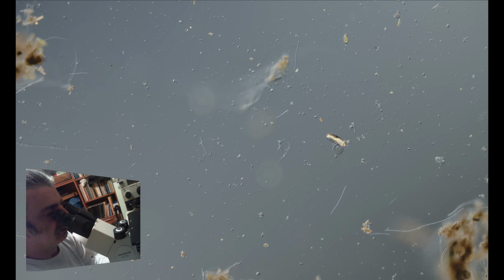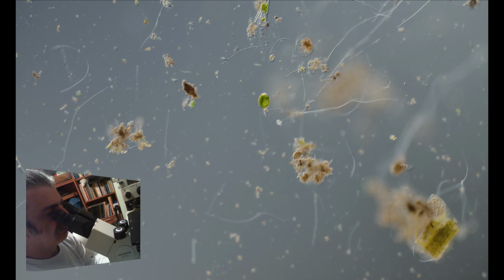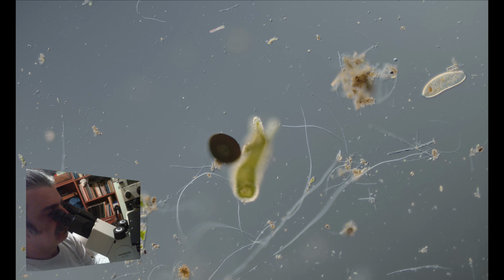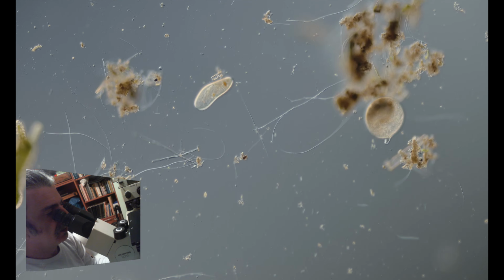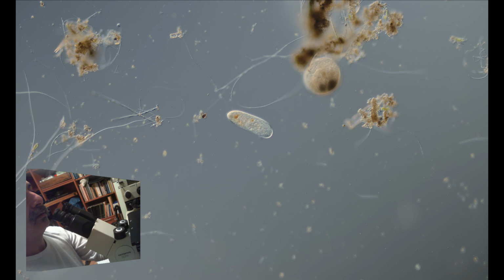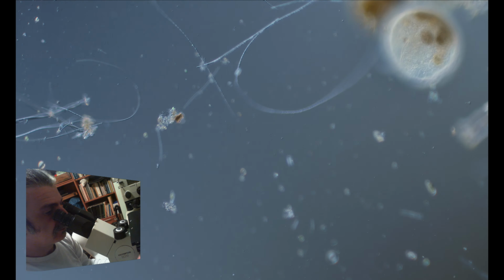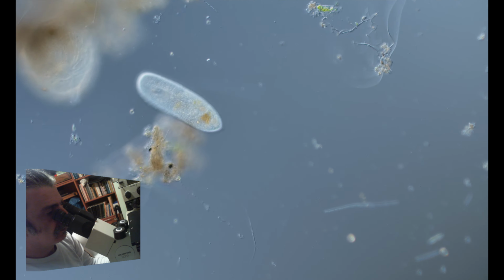You see it's very, very peculiar behavior. Here is another one called, I think it's a frontonid. Let's look at it in more detail.